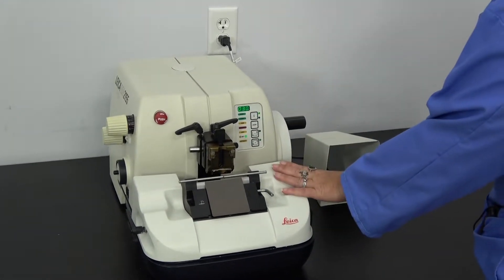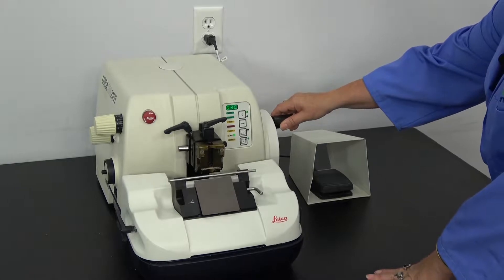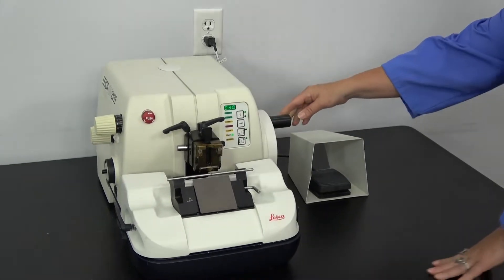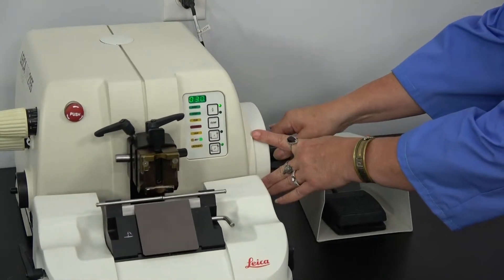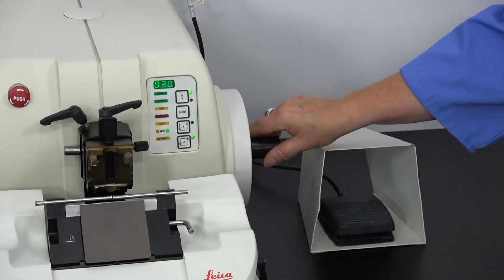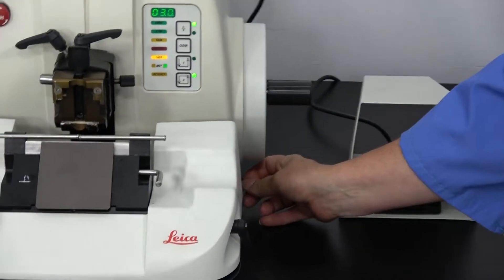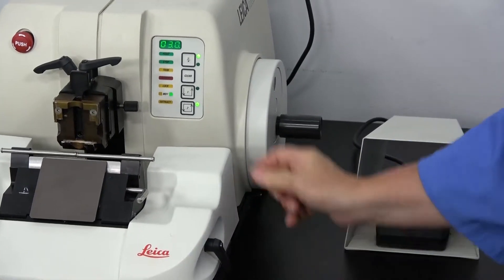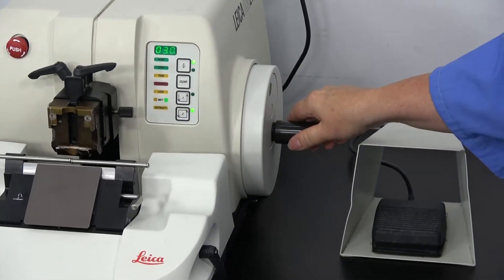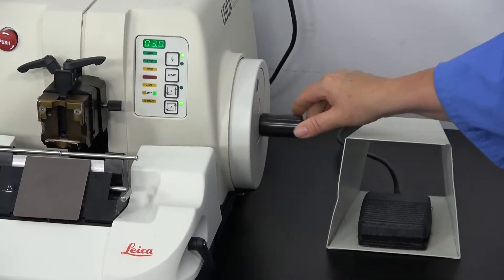This is an automatic microtome that runs with a foot pedal. This is your hand wheel. It has the nice bonus that you can move this hand wheel so that the handle is at the center so it doesn't run into your hand. The lock for the hand wheel is underneath, so this makes it not move. Unlock it and this light goes off and it will move. You can move this back to the traditional position or in the center.